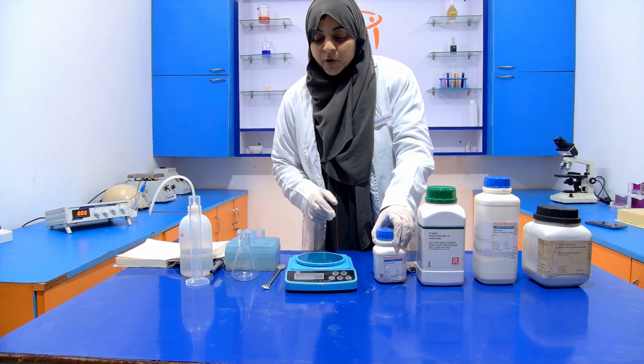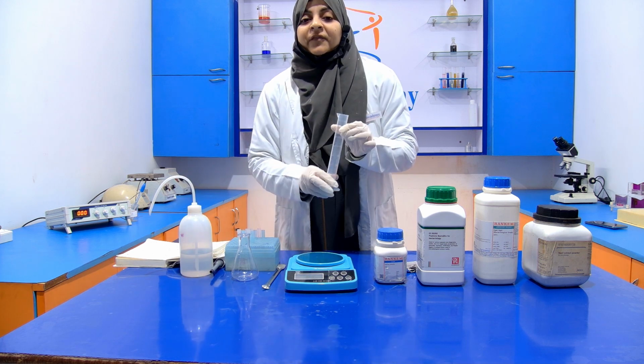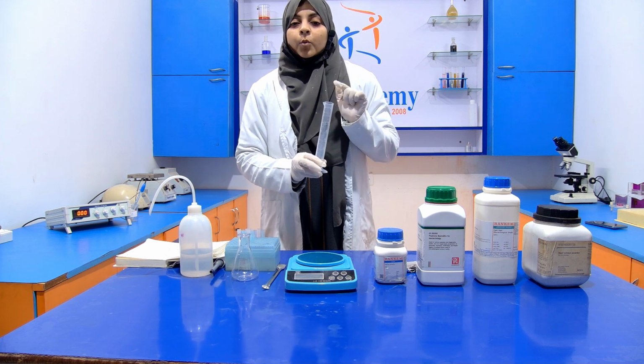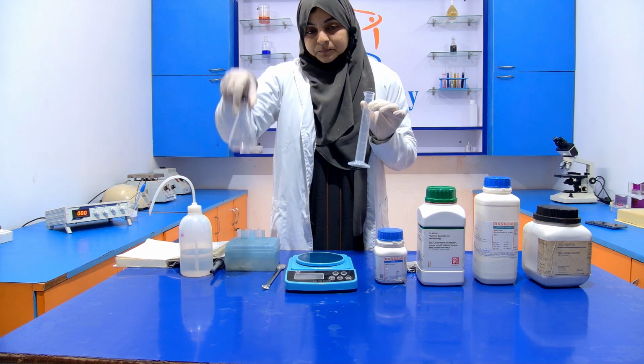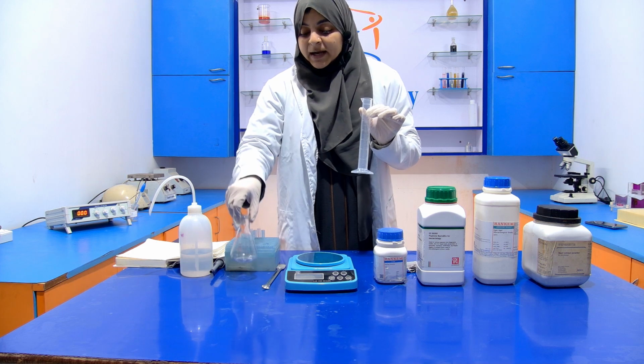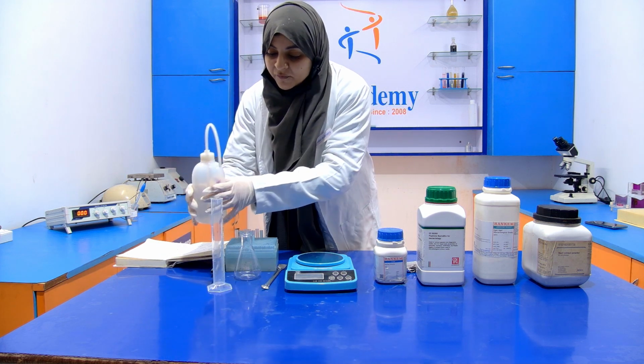So first of all, we measure 50 ml of distilled water with the help of the measuring cylinder and put it into the conical flask. Now I am going to take a measurement of water.